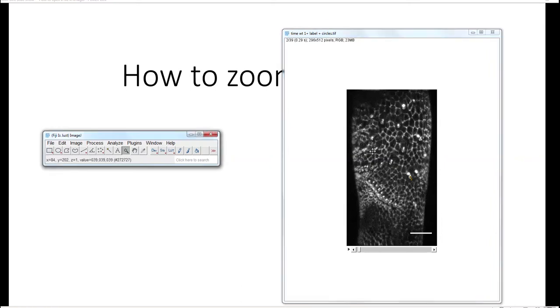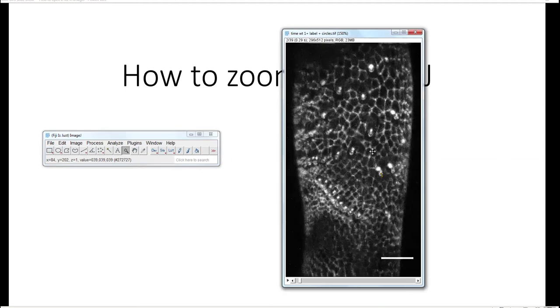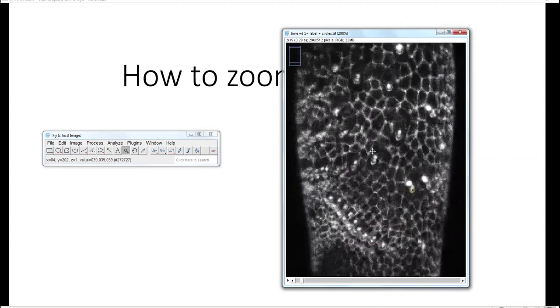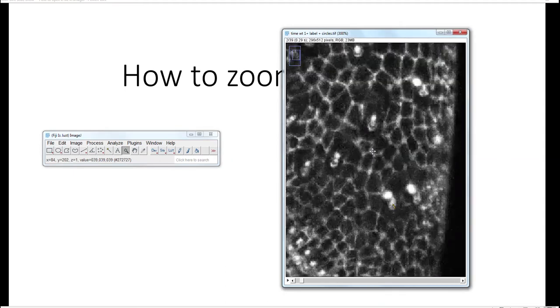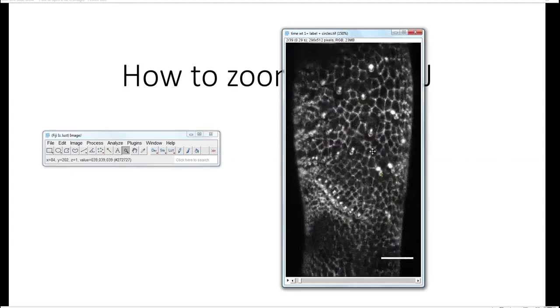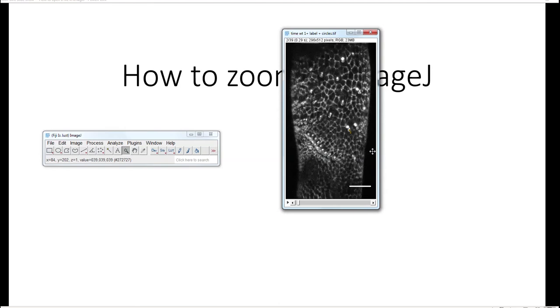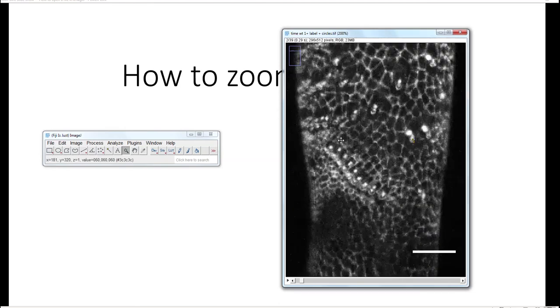If you go to the movie and left-click, you can zoom in. If you right-click, you can zoom out to the size that you want.